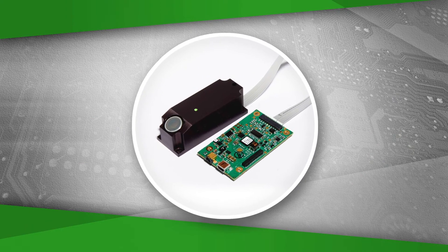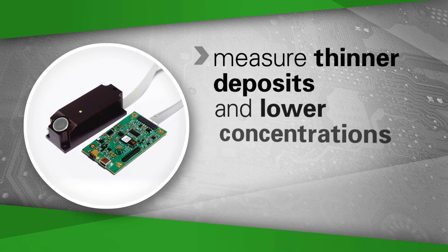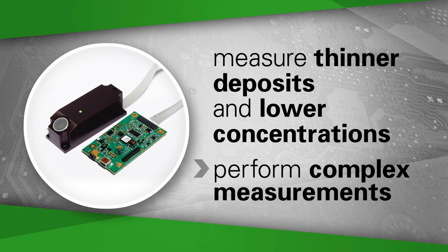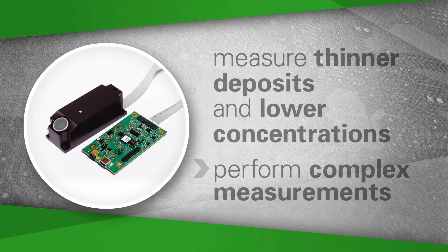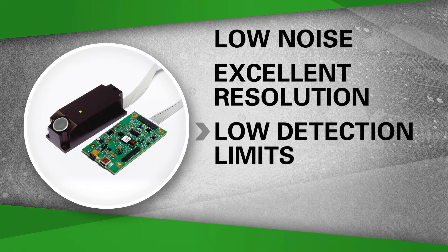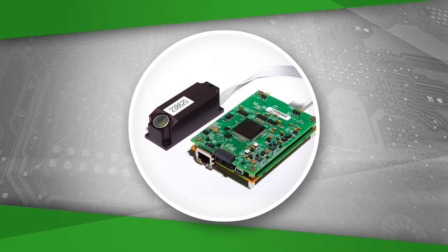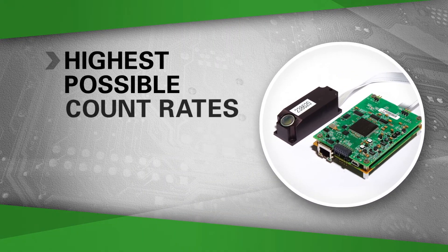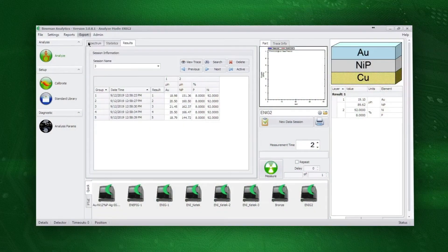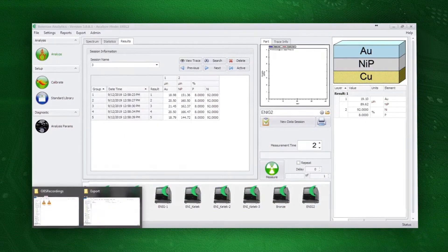Bowman's silicon pin diode detector provides exceptional spectral resolution, allowing operators to measure thinner deposits and lower concentrations and to perform complex measurements. Silicon pin detectors are low noise, have excellent resolution and low detection limits, and are extremely stable. Bowman's silicon drift detector produces the highest possible count rates and the highest spectral resolution. Bowman G-Series XRFs have extensive Excel reporting capabilities and built-in database search features.